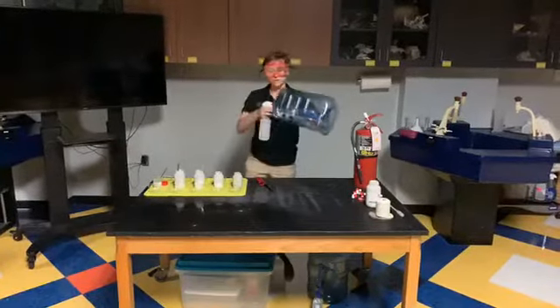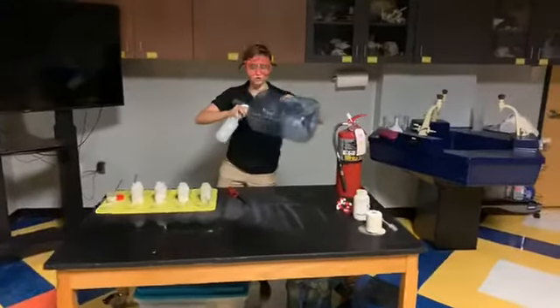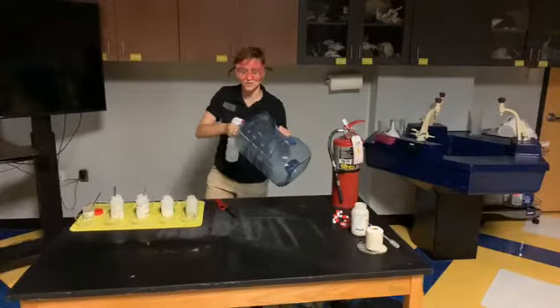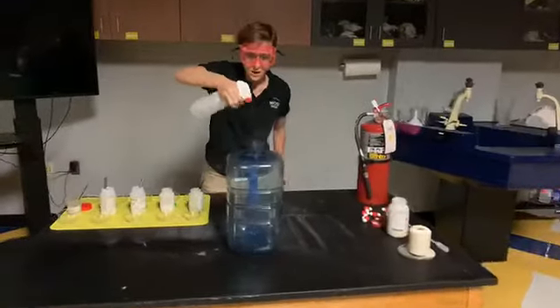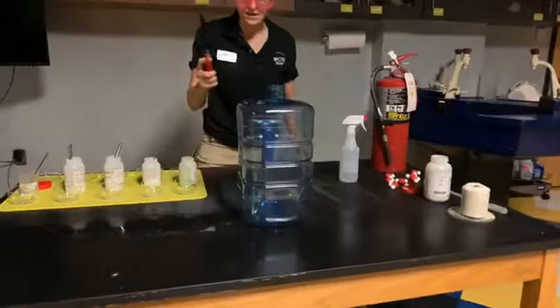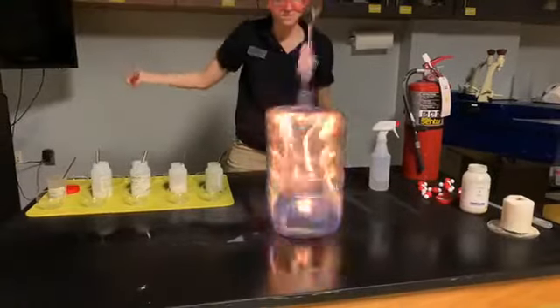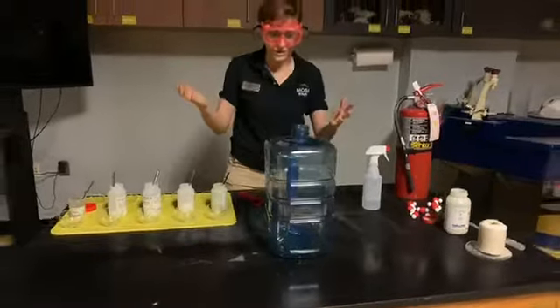And let's put some more of the MOSI sauce here into our famous whoosh tube. I'm going to put quite a lot in here. And you're going to have to pay close attention when I do this because the reaction happens very, very quickly. I'll put some right at the top and we'll zoom in close so you guys can see. And 3, 2, 1. Whoosh.